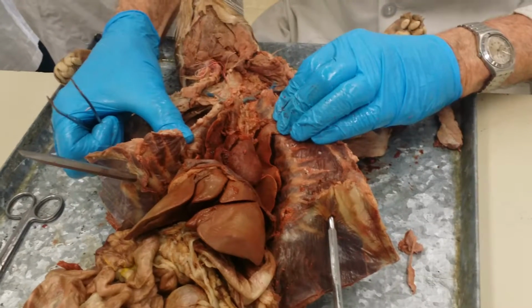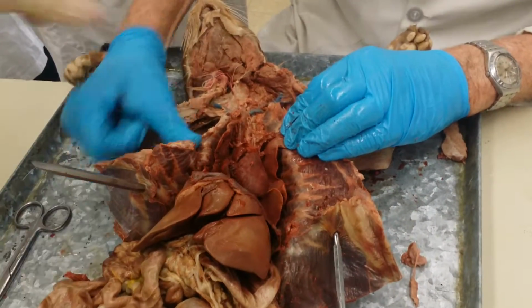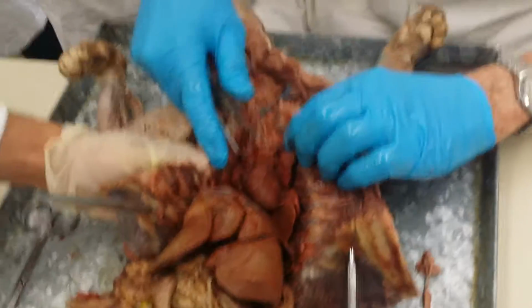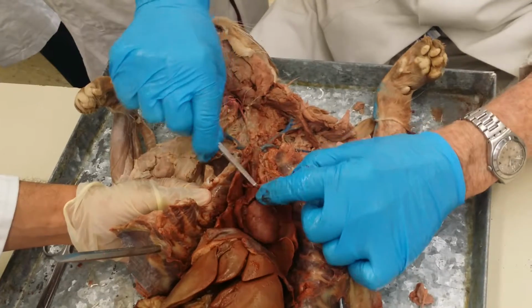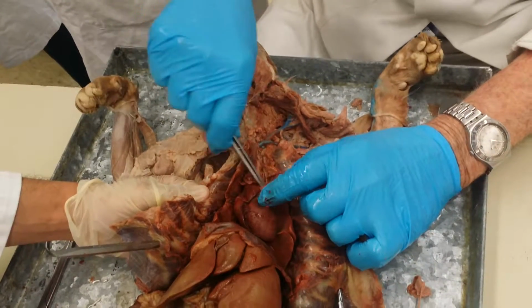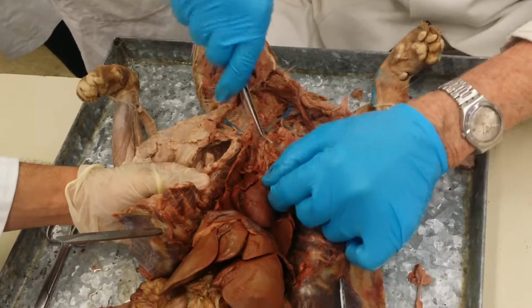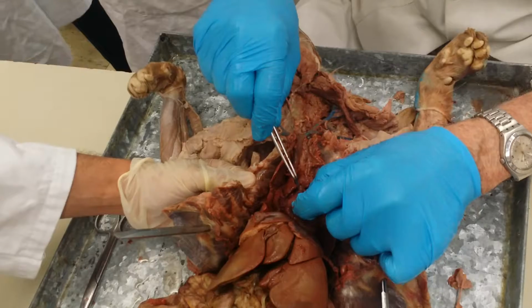You got your gloves on. You got yours on. Hold your thumb on that, please. Thank you. That's a little bit of fat on the aorta, and many organisms, many humans, develop it there as well.